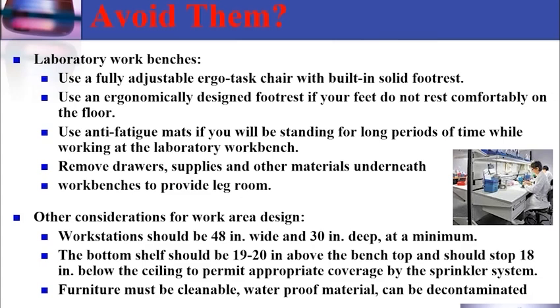Furniture must be cleanable. Waterproof material can be decontaminated. Expandability and flexibility: use generic lab flexible engineering systems, movable benches, adjustable shelves, and mobile casework.